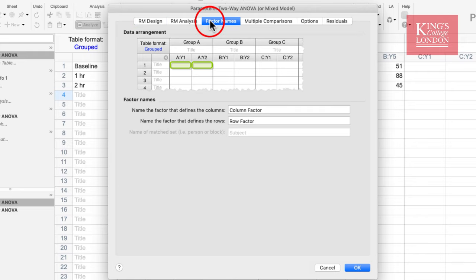The third panel is to do with the names of the factors you are using. Prism asks you to enter the column and row factor. Whilst this is optional, it's handy to enter what the columns and rows represent, because it will give you a better understanding of the outcome of your statistical tests once this has been completed.